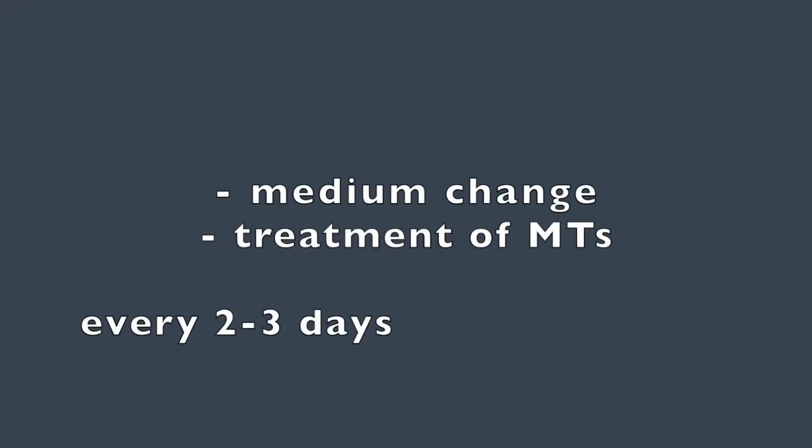A medium change to an FBS-free version of the medium, or treatment of the microtissues with different substances, can now be performed every 2 to 3 days until endpoint. The microtissues are now ready to be analysed. We will now show you how to perform an ATP viability assay, and the work can now be performed under non-sterile conditions.